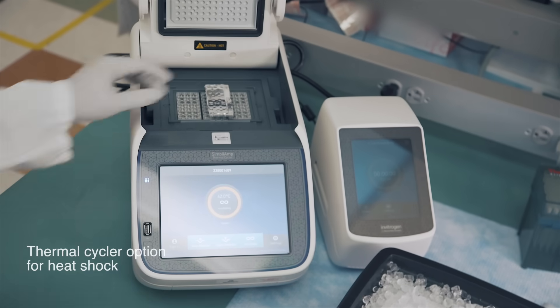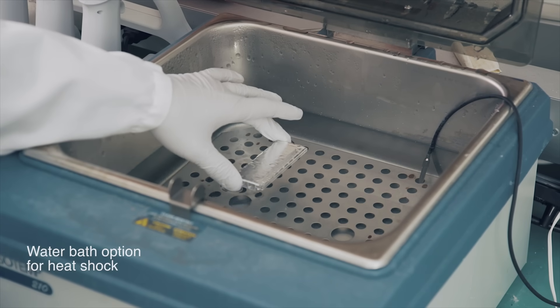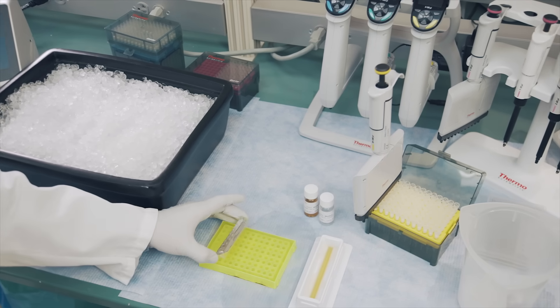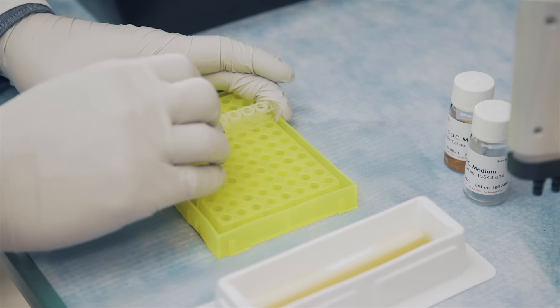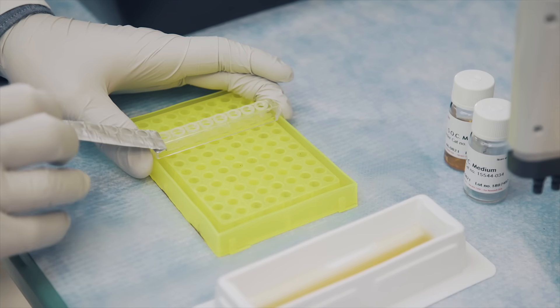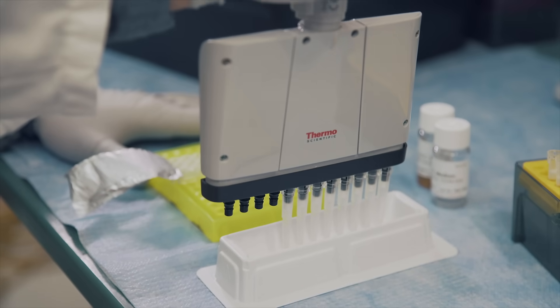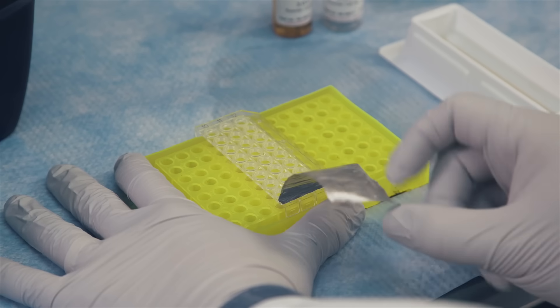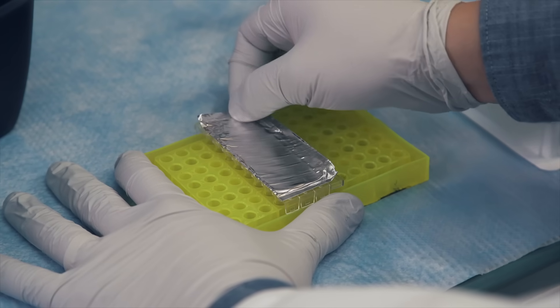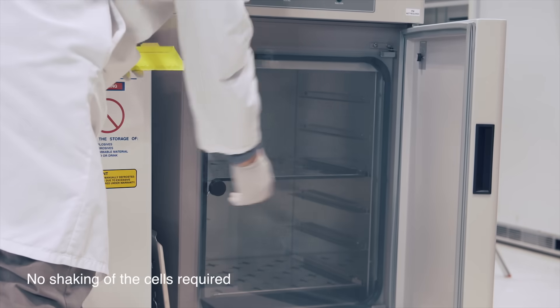Incubate the mixed cells and DNA on ice according to the protocol. Perform the heat shock steps as directed in the protocol using your preferred heat shock method. After the recovery on ice, move the cells to your bench top and carefully remove the adhesive seal. Add the supplied SOC recovery medium and replace the seal to incubate the cells at 37 degrees Celsius for one hour without shaking.